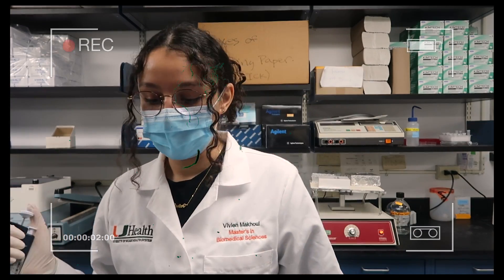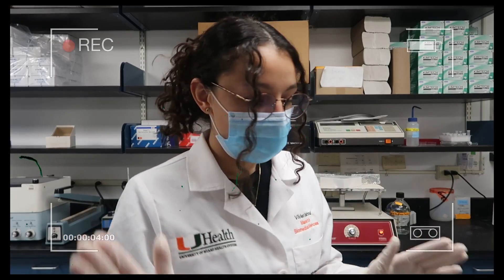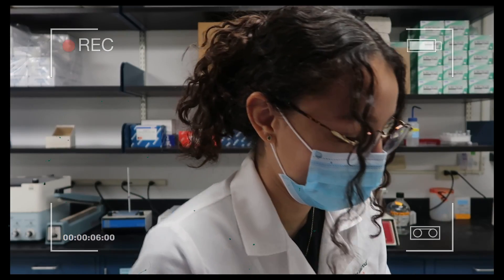Every step of an immuno is the most important part. Oh no no no. Primary on, morale low.